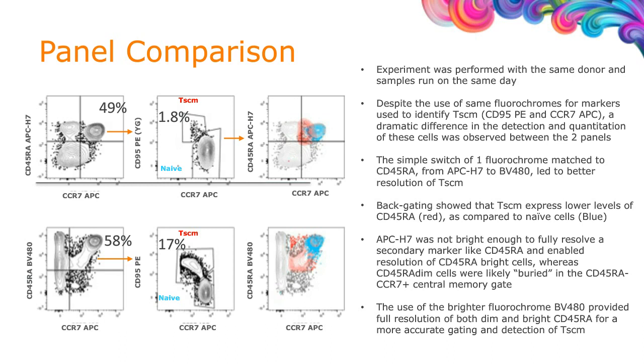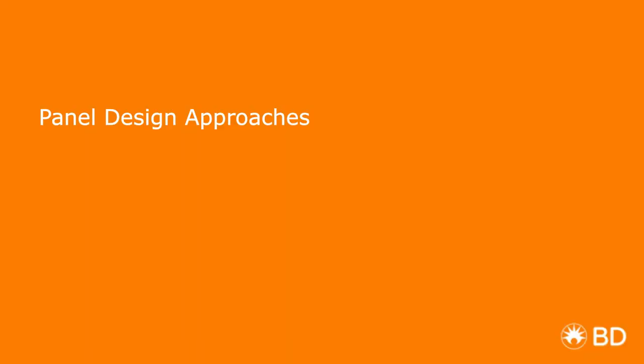So as we move forward in the last few slides here, there is a question that's a common one in this field about, where do we start a panel? And that's a hard one because individuals have all different ways to start a panel. Sometimes we have specific colors on specificities that we always want to see.